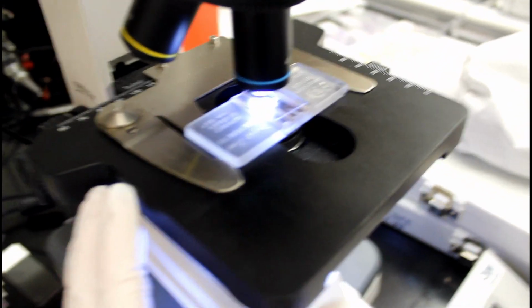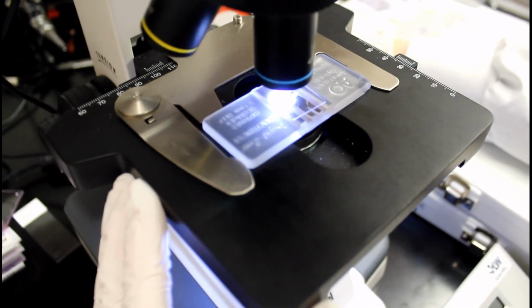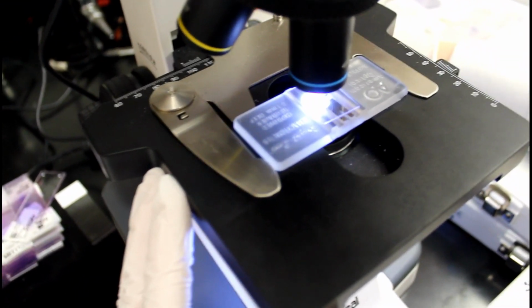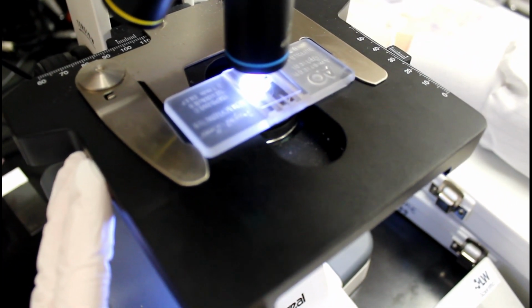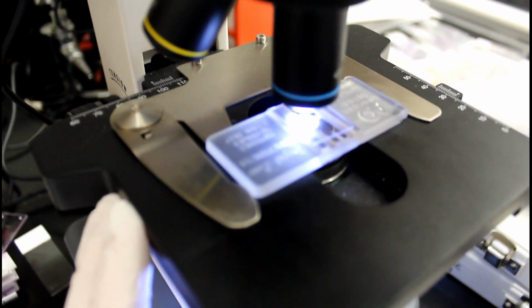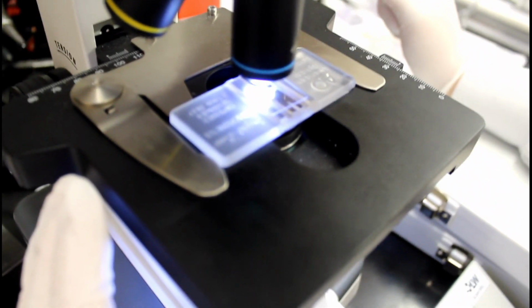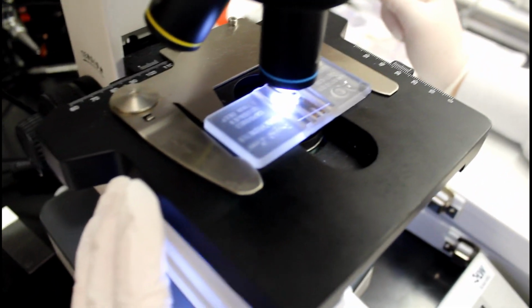Put the hemocytometer on the microscope stage. Use the 40x objective and begin counting both live and dead cells. Include the squamous epithelial cells as well. Do not include red blood cells. During the counting, you will count all 4 corner quadrants of the hemocytometer.